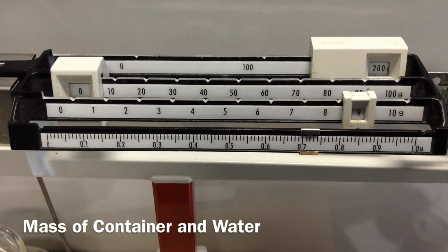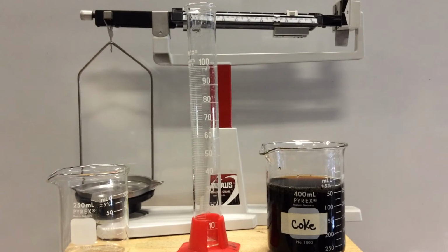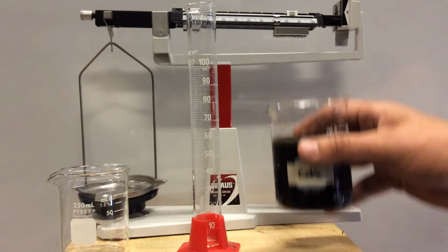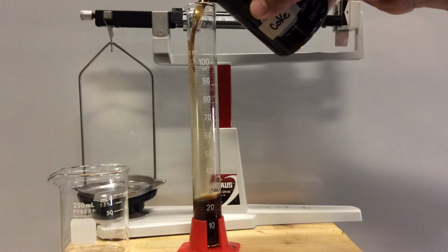Notice for those that are saying, wow, water should have a density of 1, this seems to be a lot less. Remember, density of water is 1 actually at a certain temperature, 4 degrees. So this is a lot warmer than that. It's about 22 degrees in here. So we can expect our density to be a little less than 1. Let's begin with our second liquid, regular Coke. And let's try to get to the 100.0 milliliter mark.